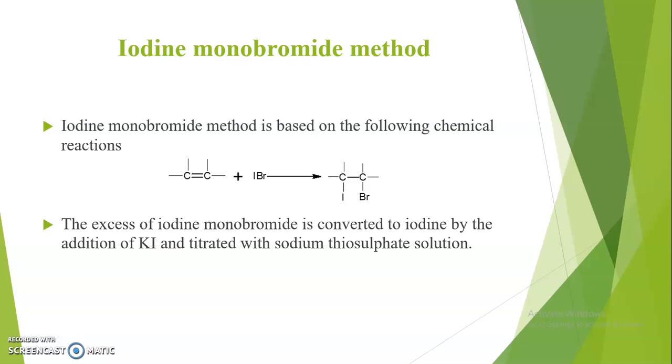So liberation of iodine takes place due to this reaction. Further, oxidation of iodide ions and reduction of the iodine monobromide will take place.